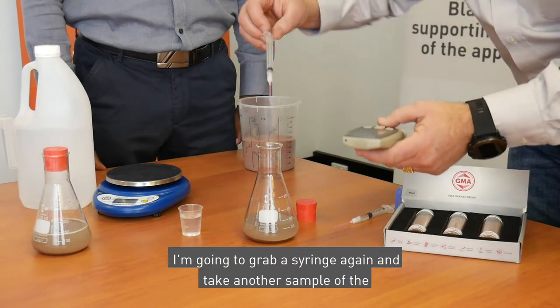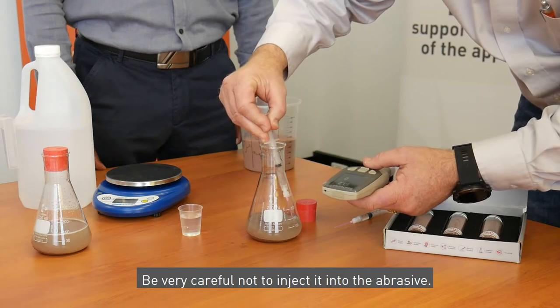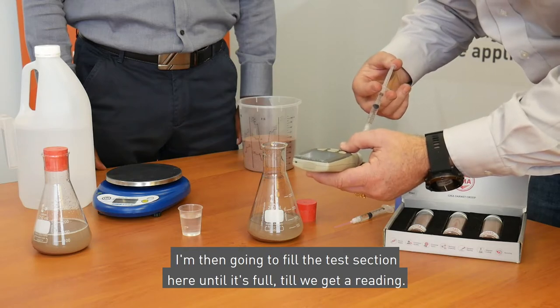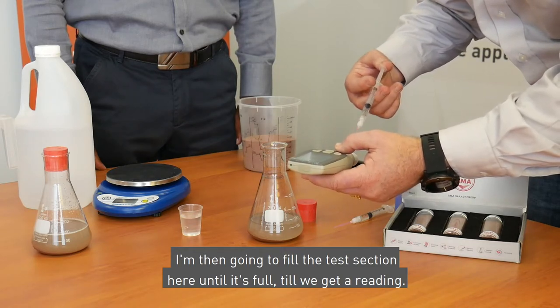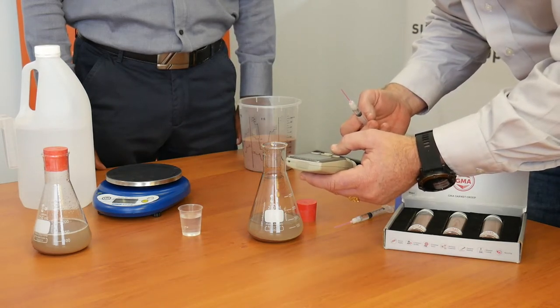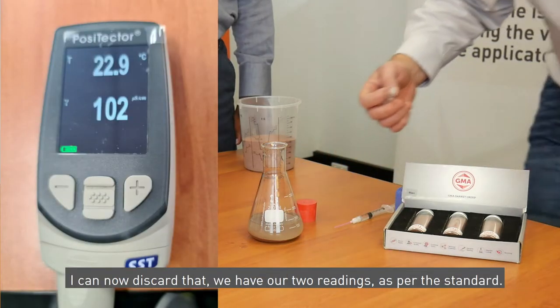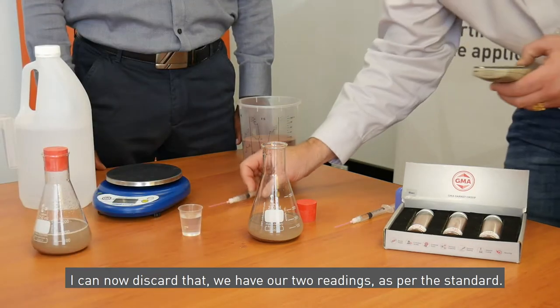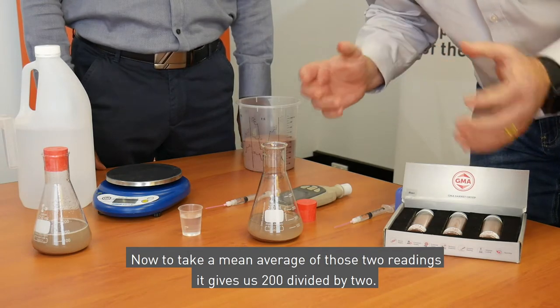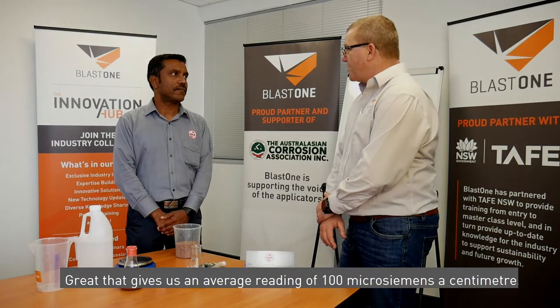I'm going to grab a syringe again and take another sample of the water as per the standard — be very careful not to inject it into the abrasive. I'm then going to fill the test section here until it's full until we get a reading; this takes a few seconds. It looks like the second reading we've got here is 102 microsiemens per centimetre. I can now discard that. We have our two readings as per the standard. To take a mean average of those two readings: 200 divided by 2 gives us an average reading of 100 microsiemens per centimetre.